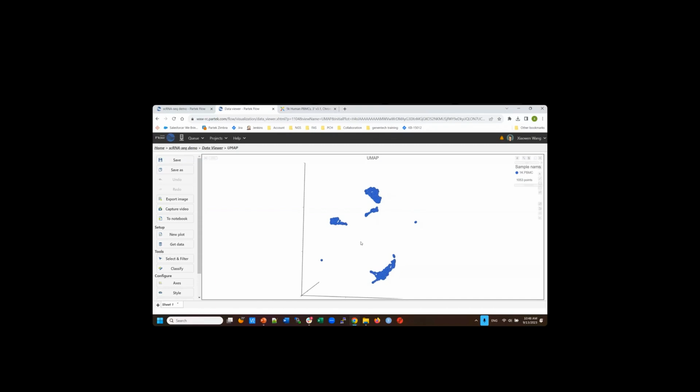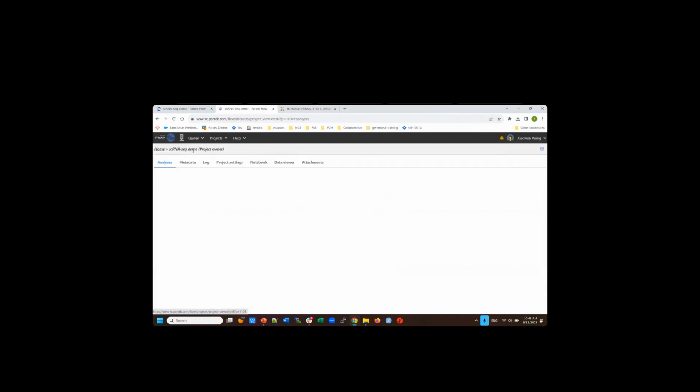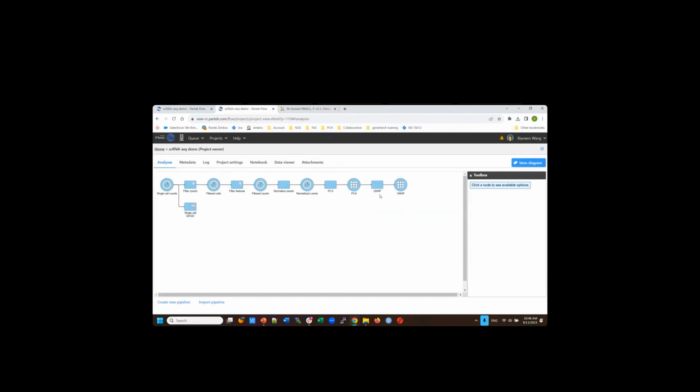That's the major step. So if visually we see some clusters, but I don't really know, statistically, based on the gene profile, do they really form a cluster? I would recommend you perform cluster analysis using statistics to partition the data. So the first thing you want to do is, based on PCA, use a graph-based clustering. The nice thing about graph-based clustering is you don't have to tell it how many groups you want to partition the data into. It will figure it out, okay?